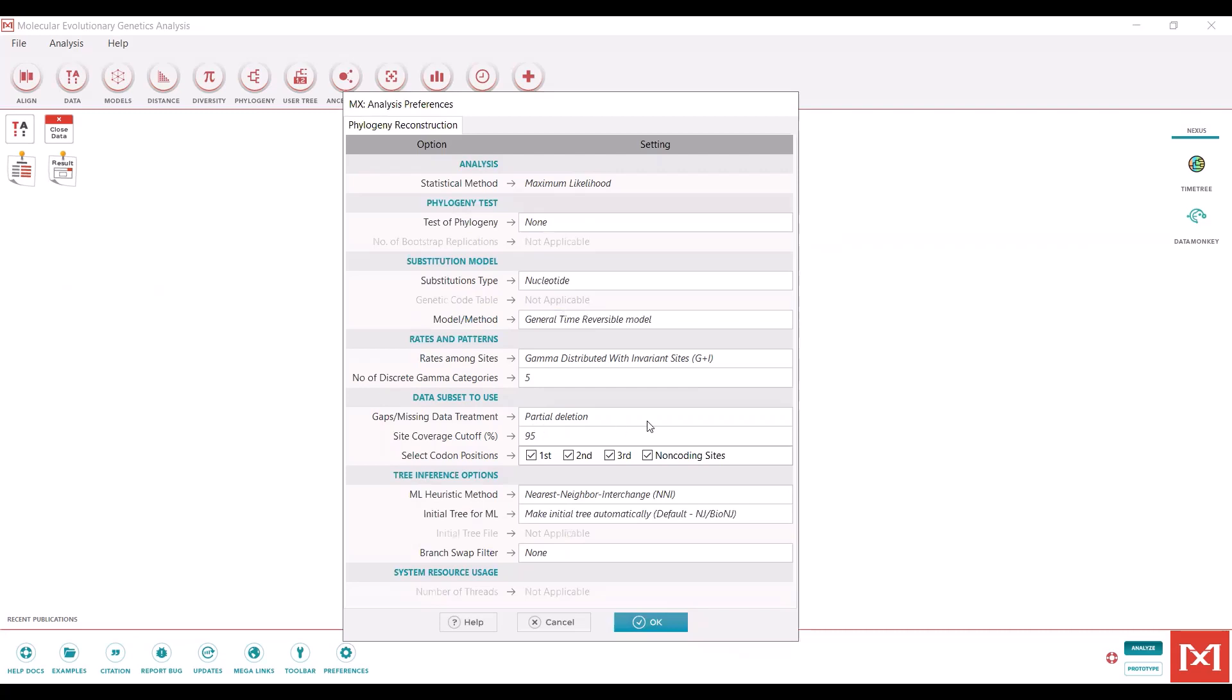I'm going to keep the partial deletion at 95% and incorporate all codon positions. Then when you are all done with that, you can hit OK.